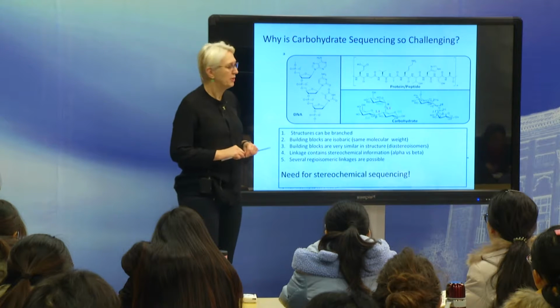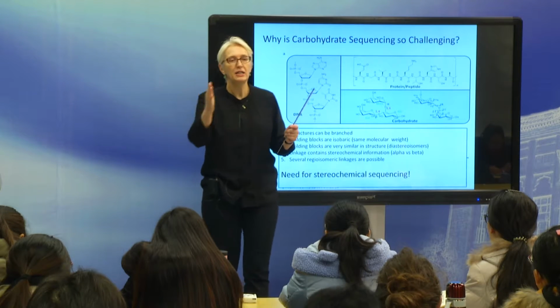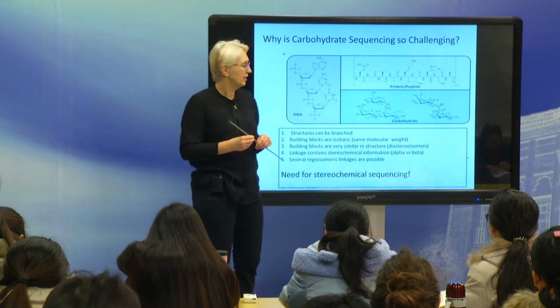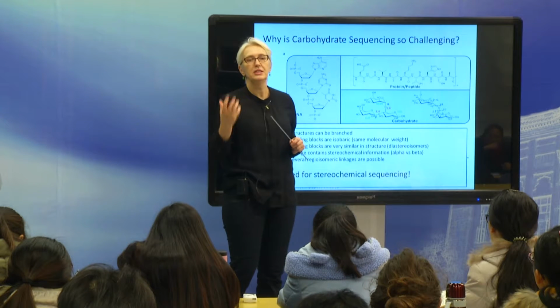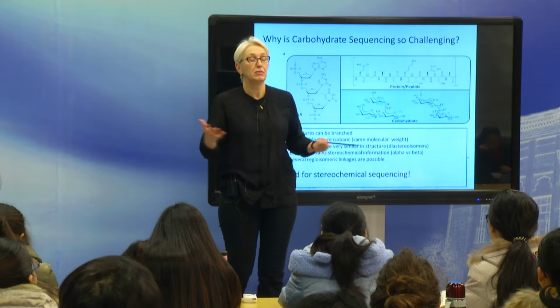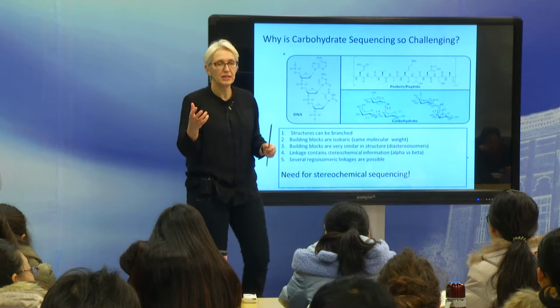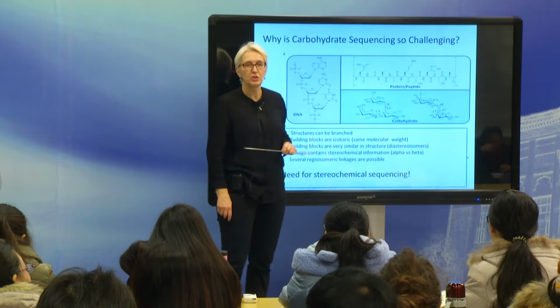So basically, if any one of you has done some protein sequence determination, what you do is you fragment the proteins into peptides, and then you chop them up in the mass spectrometer, and you just basically measure the mass of each building block. That's by far the best way nowadays to get a protein sequence. That's what is generally done nowadays. So mass spectrometry is now starting to creep in as a very high throughput sequencing tool, and it's been tremendously successful for proteins. If you have to really identify a protein nowadays, it's actually quite straightforward to get the sequence out, generally. And that's through mass spectrometry, and I'll come back to that later on.